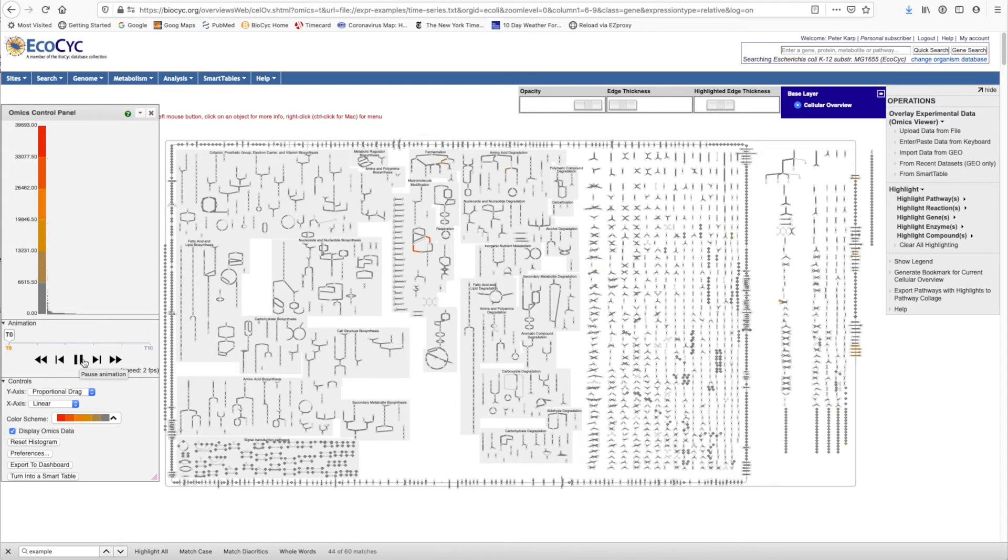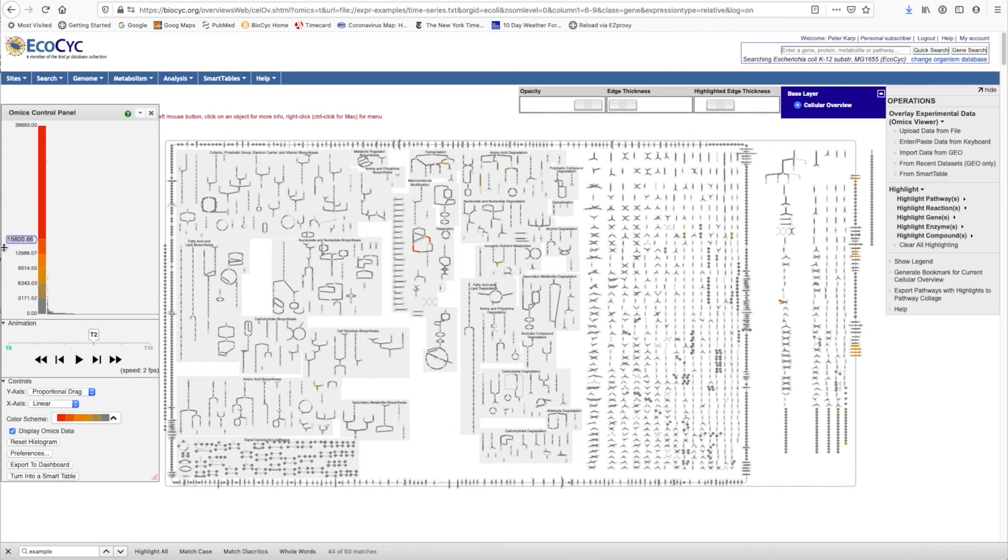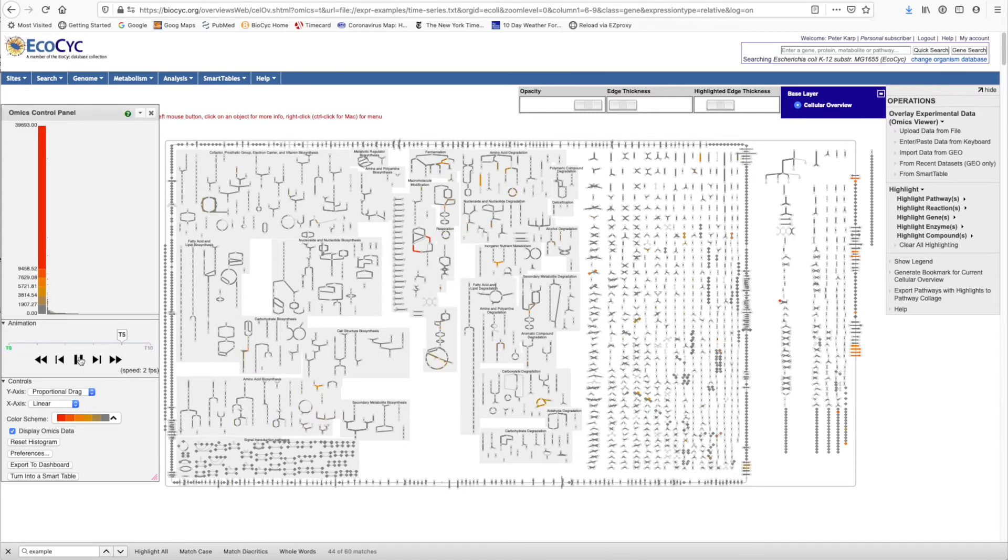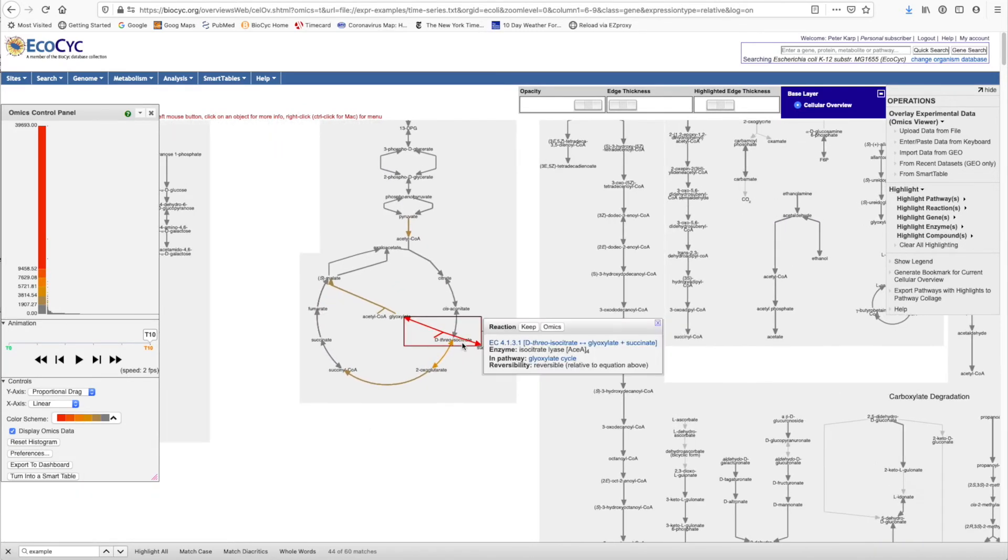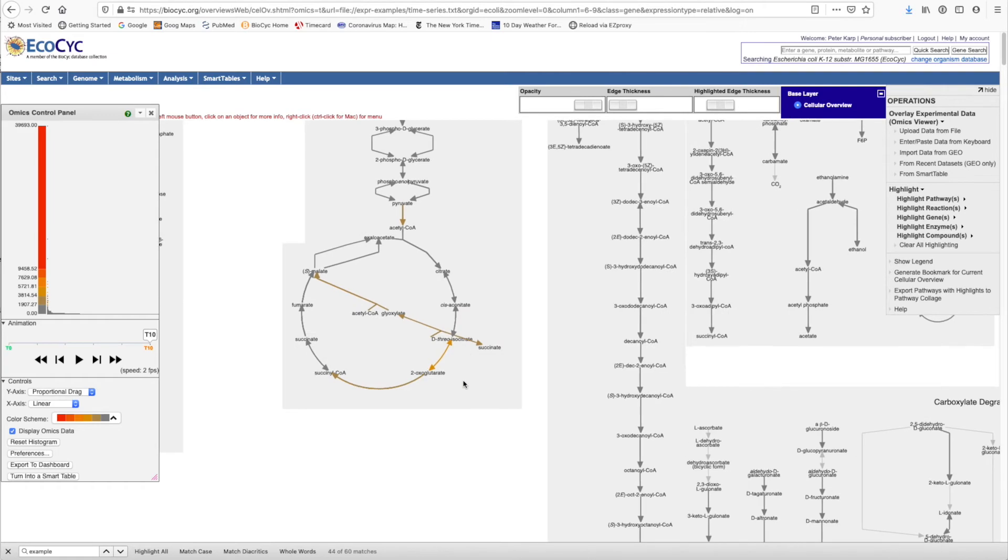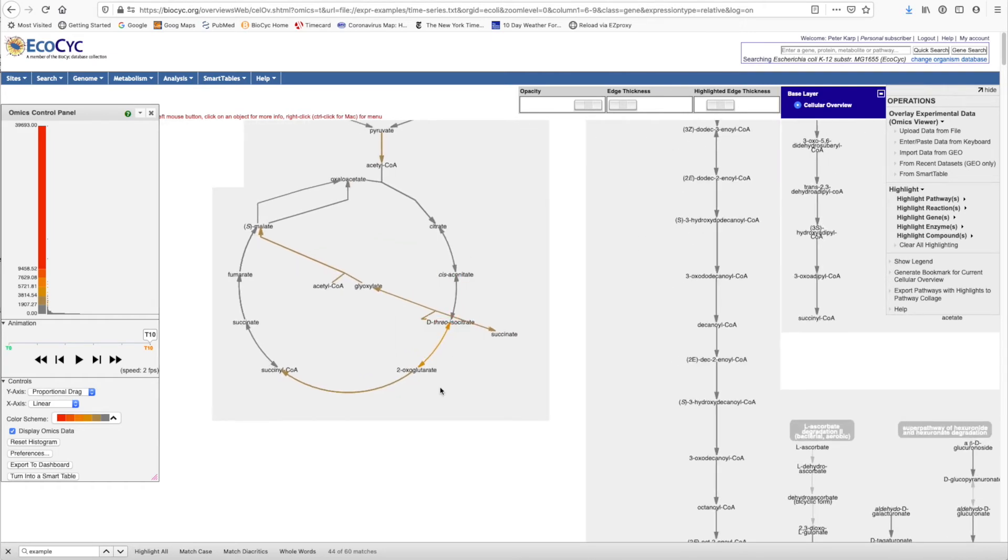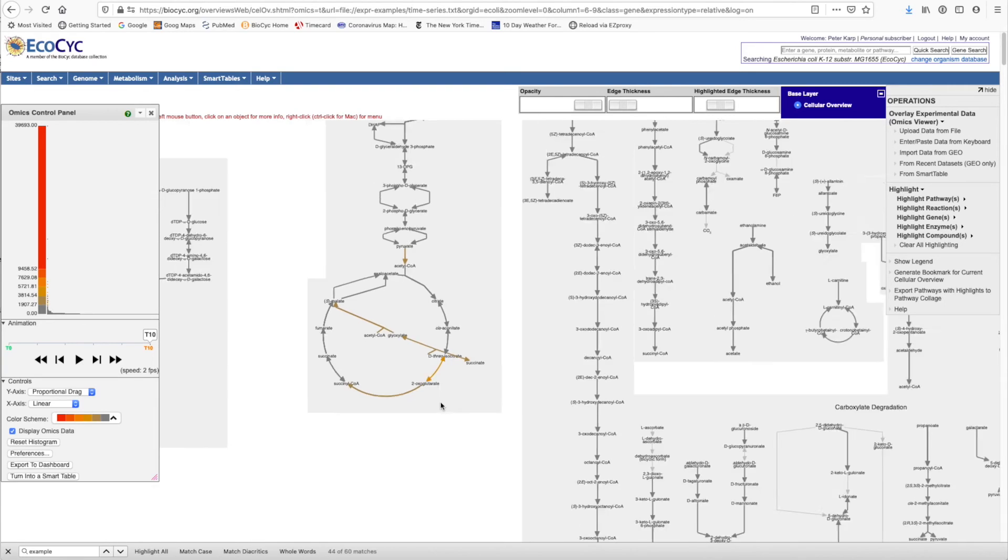Now one thing you may be noticing is that this color scheme is not optimal for this particular data set. So what we're going to do is drag the color scale downwards so that we can expand the range of the color set. And now we're seeing a lot more information. Now we can start and stop the animation or step it forward manually. And when we do so, we can zoom in on the TCA cycle to see more details of what's happening in different areas of the TCA cycle.